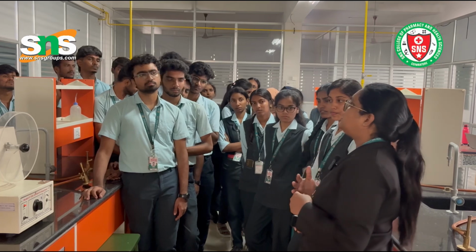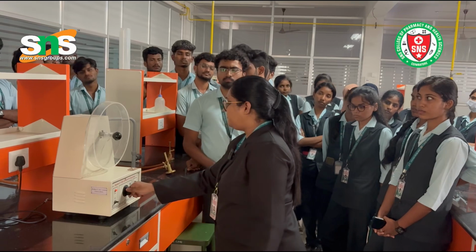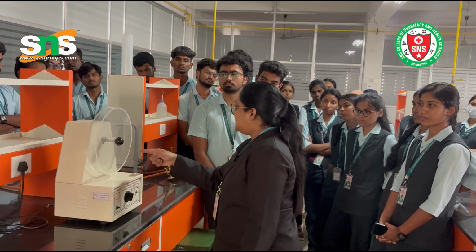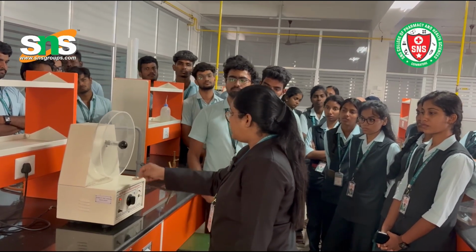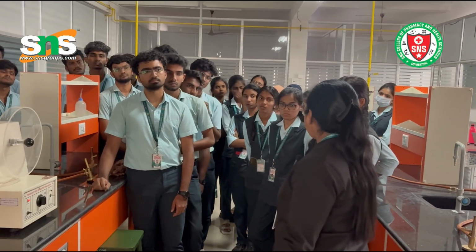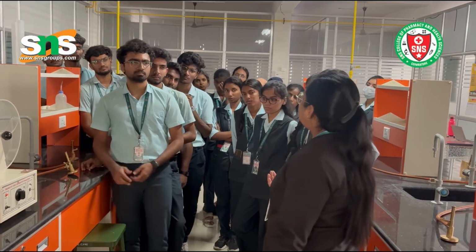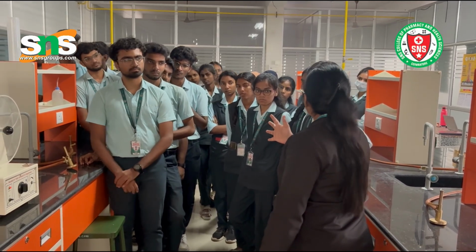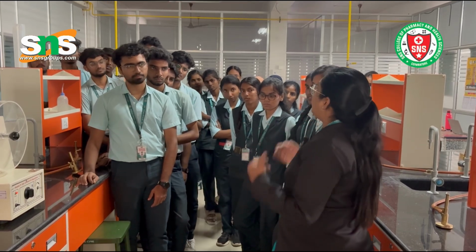Now coming to the empathize. Here, while you are working, I have turned it on. It is rotating, right? While rotating, if the speed is not proper, what happens? The breakage of the tablet happens. It leads to inconsistency of the results. The results are in error. That is empathize.